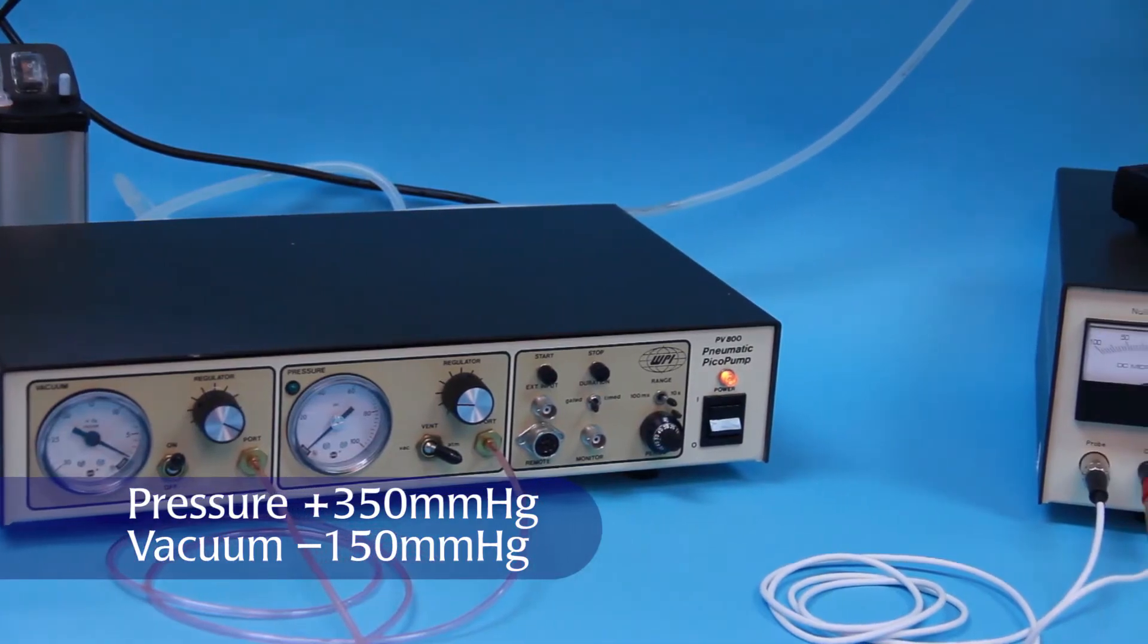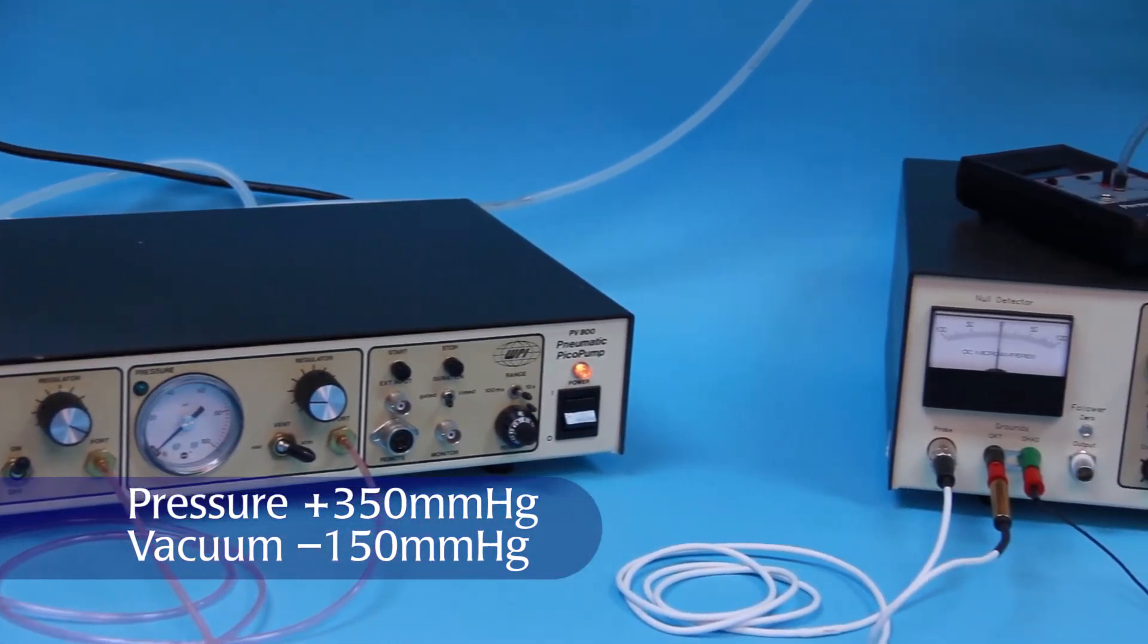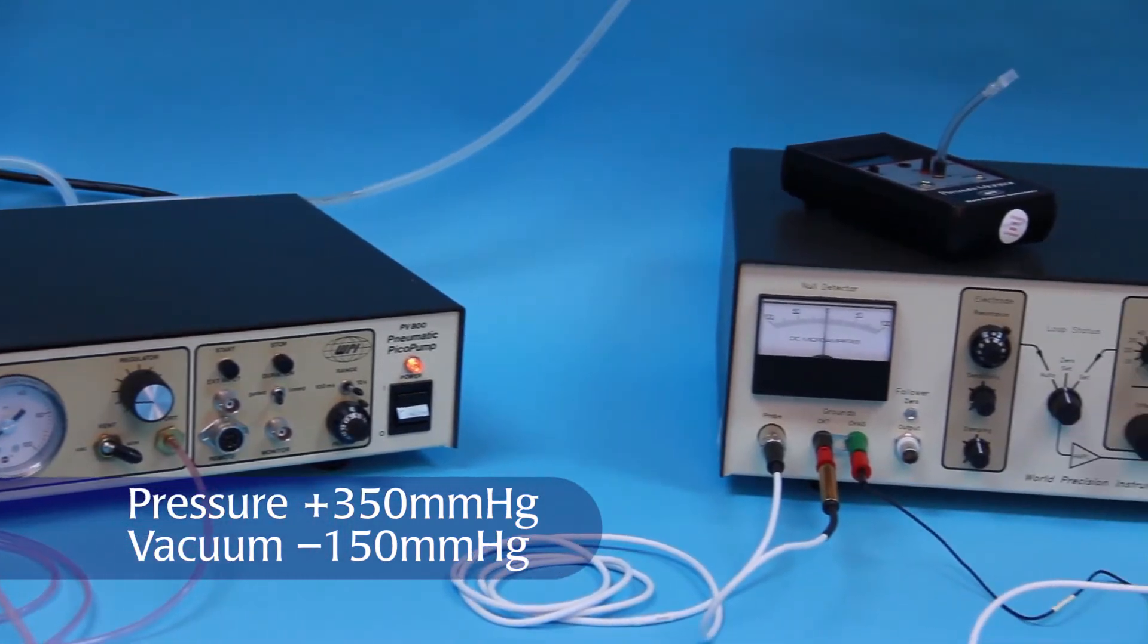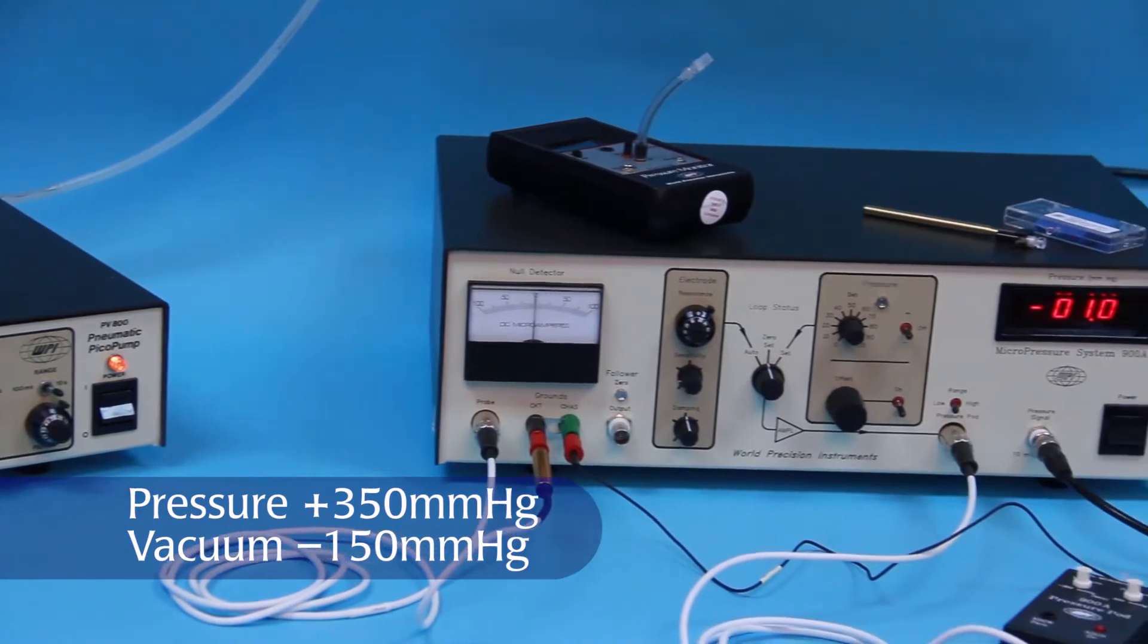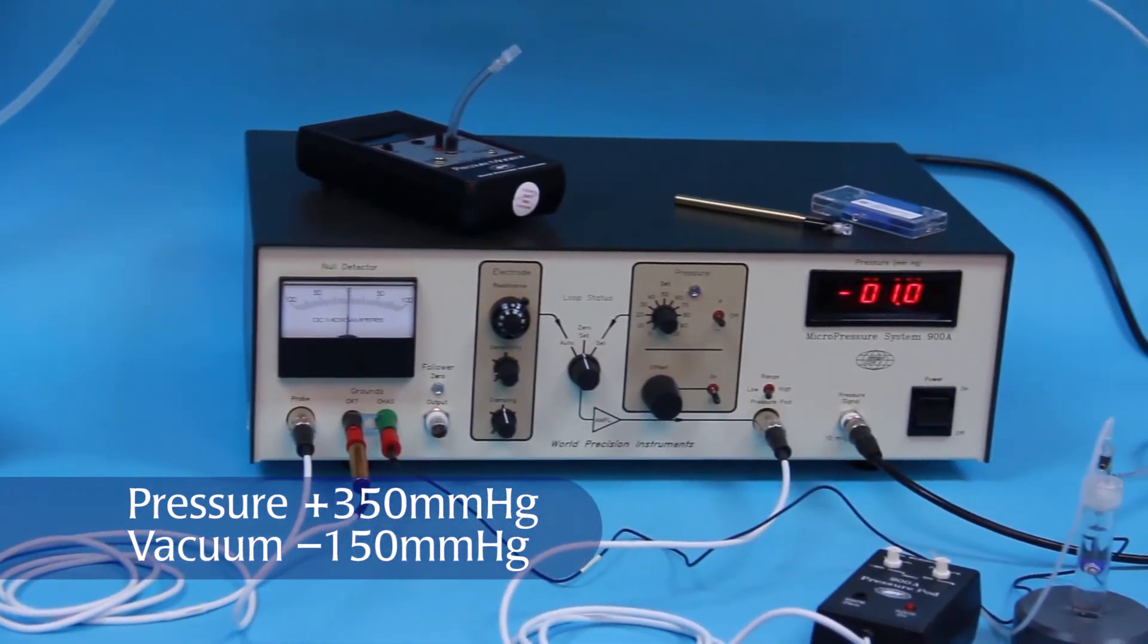The sources of pressure and vacuum for the 900A pressure pod should be regulated to approximately plus 350 millimeters of mercury for the pressure and minus 150 millimeters of mercury for the vacuum.